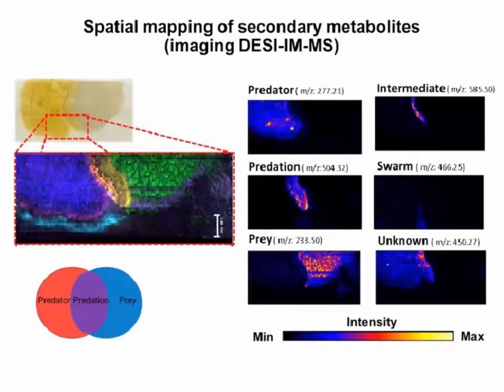To give another illustration of this type of approach, we can use these heat maps to represent our basic schematic of the predator, prey, and predation regions. But we also soon realized that the Fight Club, or predation, is more complicated and dynamic than what our basic model suggested. These images highlight the dynamic nature of each of these features within each image.